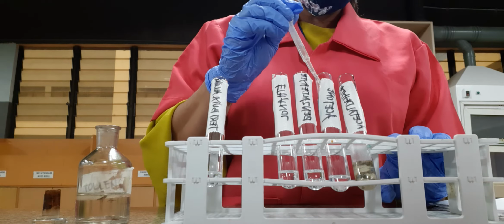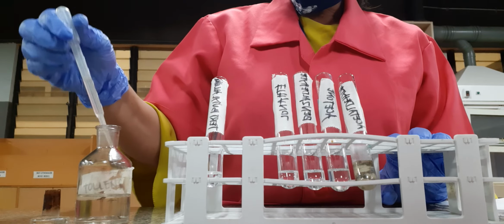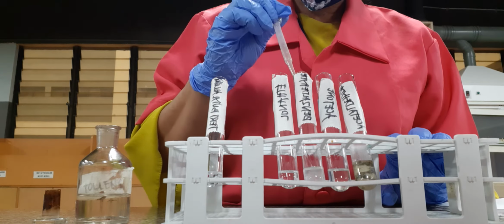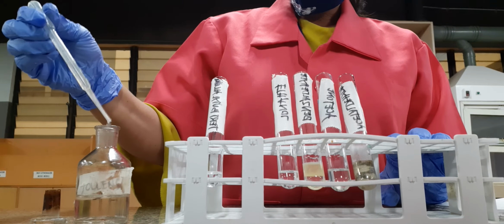Okay, and then we have acetone. And then we have benzaldehyde. Okay.